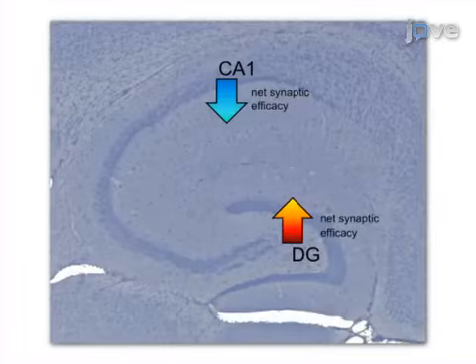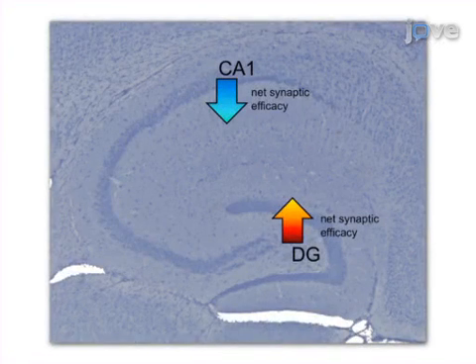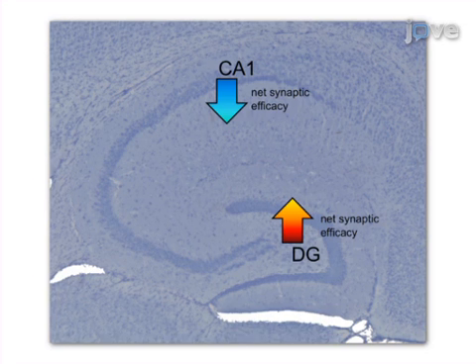The results show subregion-specific changes in net synaptic efficacy in the hippocampus based on differences between the control and brain-injured mice across the 3 recording techniques described. The main advantage of this approach is the ability to discern the effects of both the pathological state and the potential therapeutics on multiple physiological scales, allowing a more coherent picture of the circuit deficits.